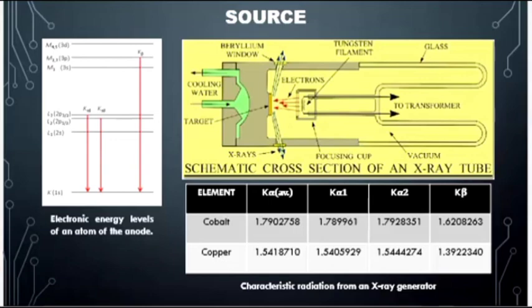The monochromator is much like the divergence slit, greatly increasing the resolution of the collected data.